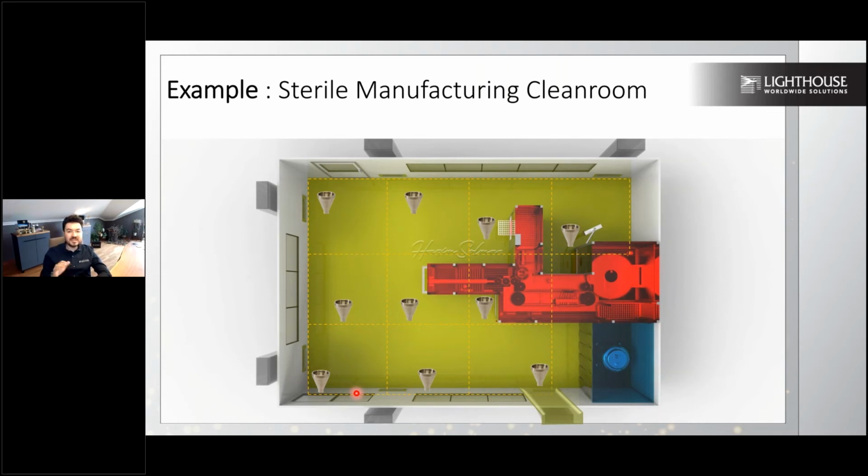Number two, don't lay your particle counters on the floor and keep the isokinetic probe and your tubing in a spiral fashion. Don't do this. Put the particle counter on top of your cart, attach your isokinetic probe directly on top of your particle counter and take the sample. Within the room itself, it's turbulent air, so you don't have to worry about isokinetic sampling. Since it's turbulent air, you can avoid using this isokinetic sample probe, still okay, but make sure you have this cart available during sampling. But if you have to use a sampling tube, we will come to that later on, but make sure that it is as short as possible, especially for classification purposes.